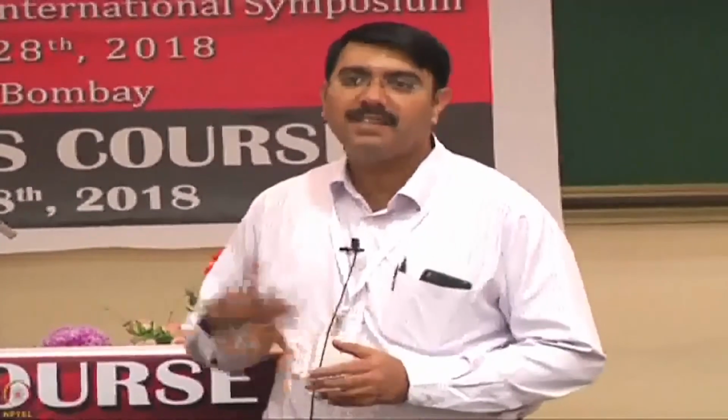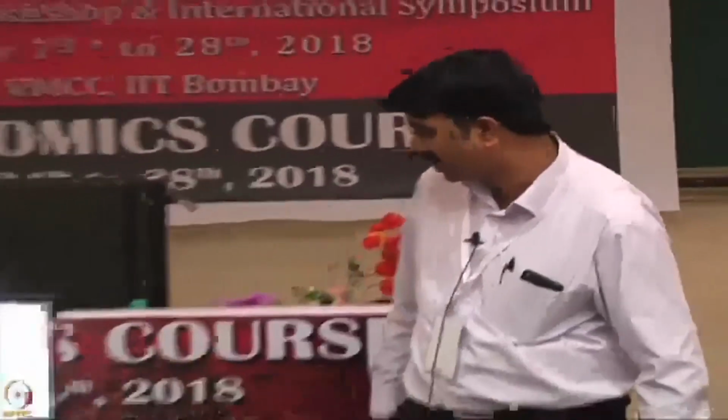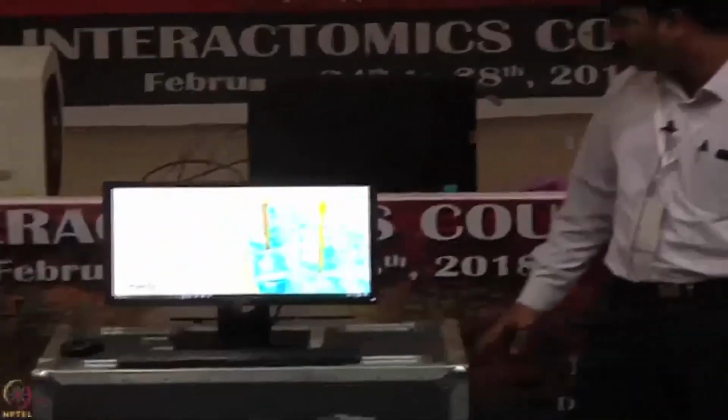We had seen the BLI presentation, the technology behind BLI as well as a few applications. Now we can do the experiment, and see how easily we can do the kinetic studies using the BLI technology. Sorry, I was planning to project the screen on the projector, but I was unable to do that. So using this, connected to the server workstation, we can do the experiments.